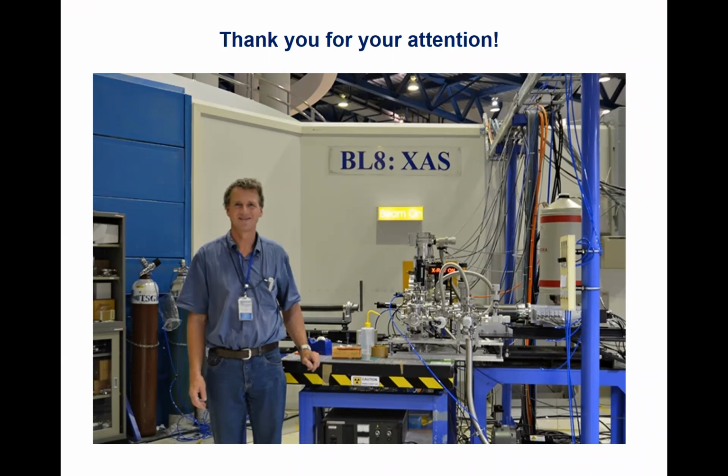Yeah. Fantastic. Excellent talk, very interesting and quite informative. So thank you. Now, there were two things. One, you were talking about the challenges of getting the right thickness of soil sample for your experiment, your beamline and so on. And of course, that depends on the beamline and various other things too. But of course, if you can characterize and correct for self-absorption, which might be a topic in one of the future talks, so that could be relevant, then that can help give you both more accuracy and insight, but also then tease out a couple of these details.